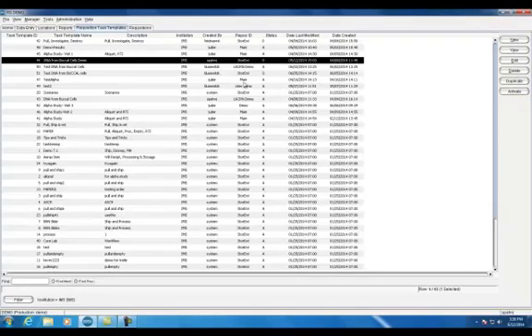The Template Manager lists templates from your institution by default. Each template gets saved with a unique ID. The template status starts out as draft so that it can be worked on and saved. Once the template is complete, the status can be updated to active. Only active templates from your institution are available for you to use in Requisitions. Let's edit an existing Requisition template that I created previously for our processing example.